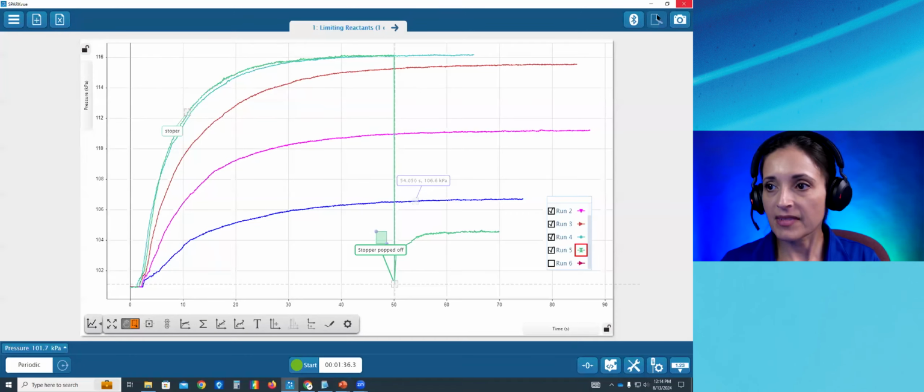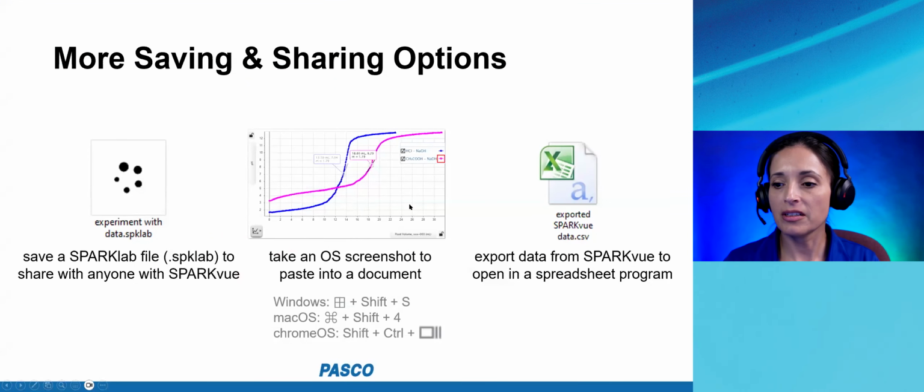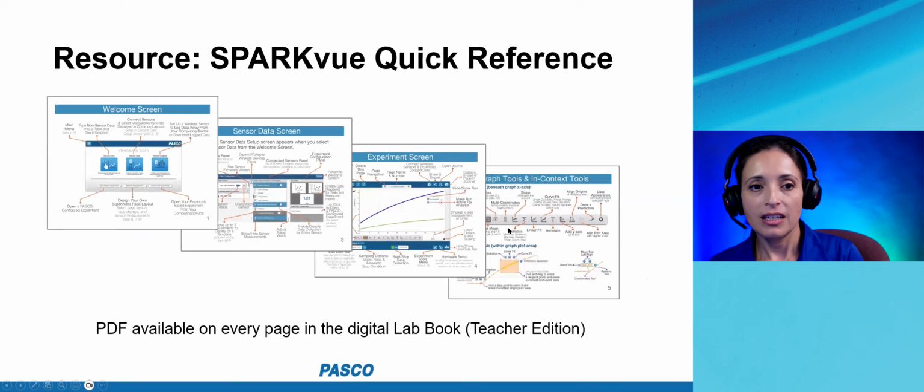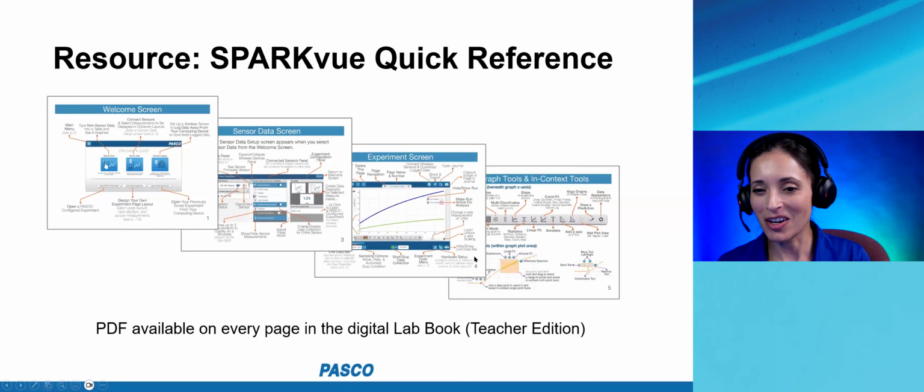Now, so those are the top ways to move and share SPARKvue data. There is a resource in your folder, like I said, and SPARKvue is incredibly packed with tools. You will be surprised at how much we've gotten in here. Just go to that SPARKvue quick reference in your resource folder. We haven't even scratched the surface today. It would take days to teach all of this.